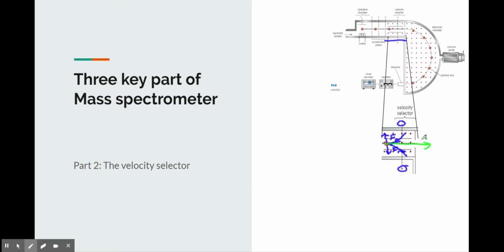And we know the ones that go through here with constant velocity, straight line motion, do so because in this chamber, they have an electric force on them that is equal and opposite to the magnetic force. So again, some particles bend up, some bend down, and some go straight on through. These are the Goldilocks ones. This is the sweet spot right here. They have the right velocity.